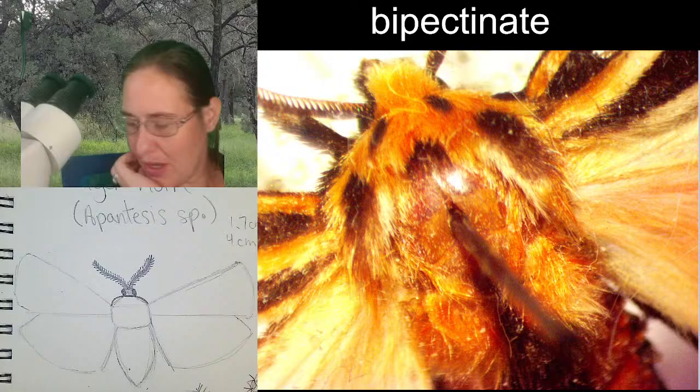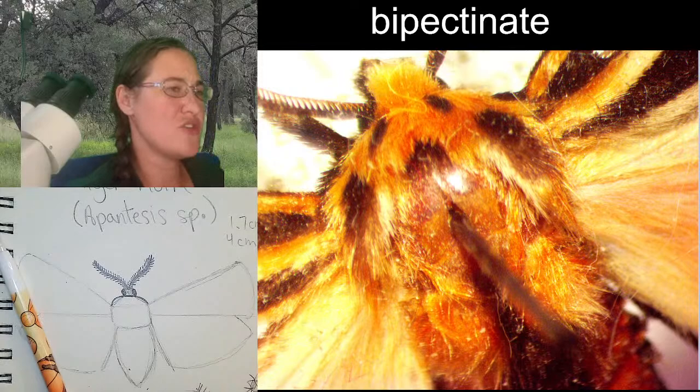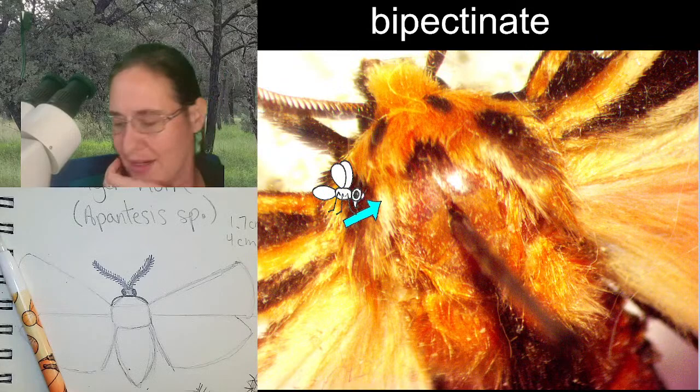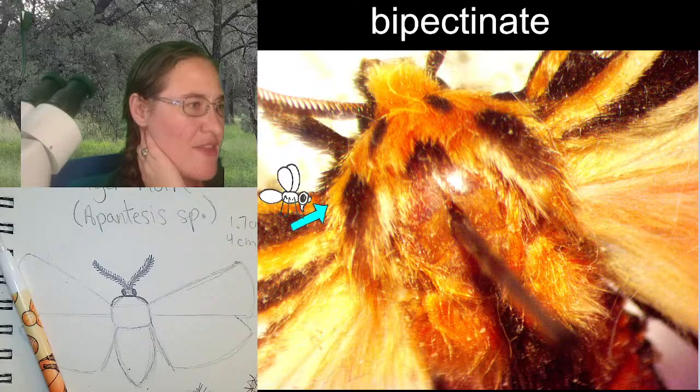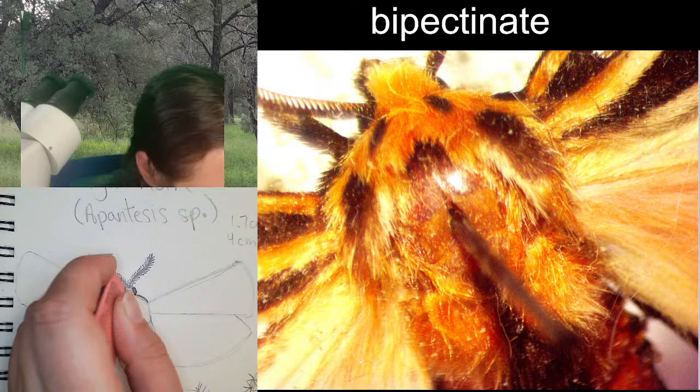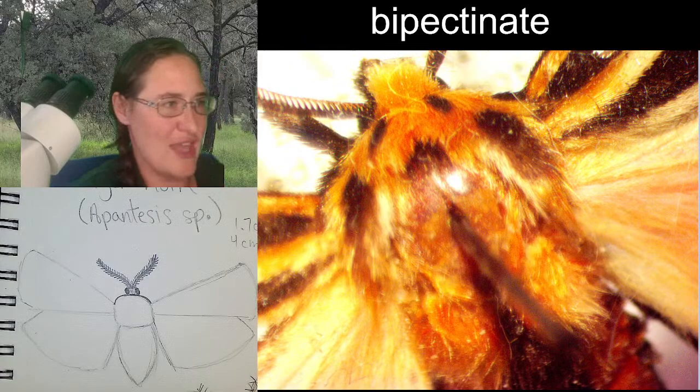In moths, a lot of times, we've talked about this before, when you spread the moth wings, sometimes you'll have these clumps of hair or scales that stay together and widen up a little bit. That is the same with this specimen. We have this piece here, and then we have this piece here. And I honestly think that they are connected to some type of flight muscles underneath. But I don't have an answer. So maybe one day we will have an answer to that one.